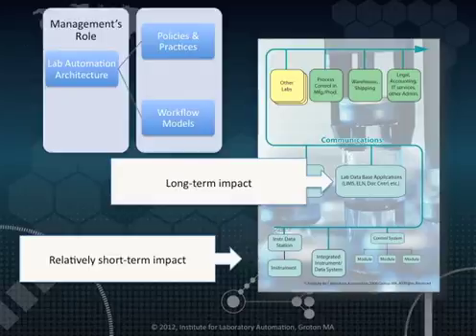Laboratories have to move away from the idea that laboratory automation is a collection of individual products and technologies. The systems relate to each other and have an impact across the laboratory when changes are made. Part of management's responsibility is to develop an overall architecture for laboratory automation technology usage. That includes the development of policies and practices that guide the planning and implementation of laboratory systems and workflow models that guide product selection. Laboratory work deserves the same level of attention as any major organizational data and workflow management application.